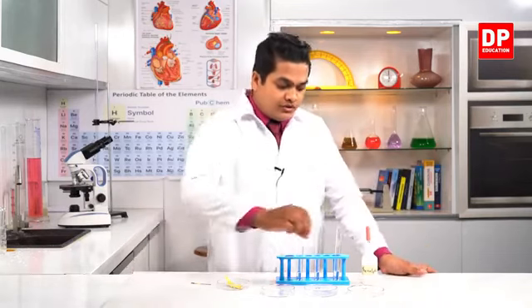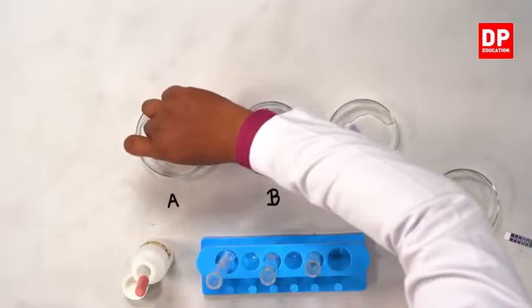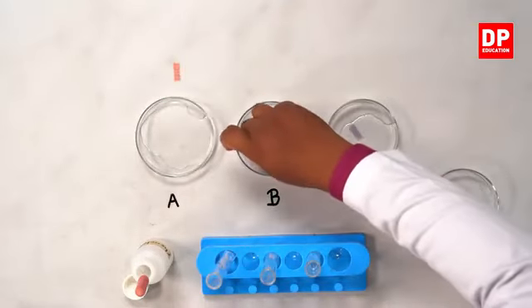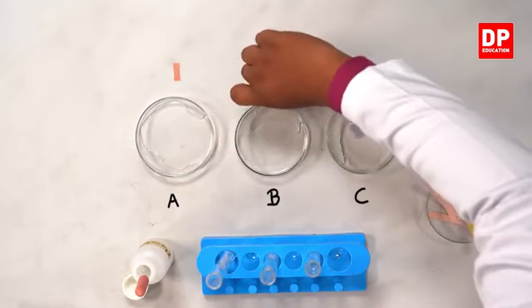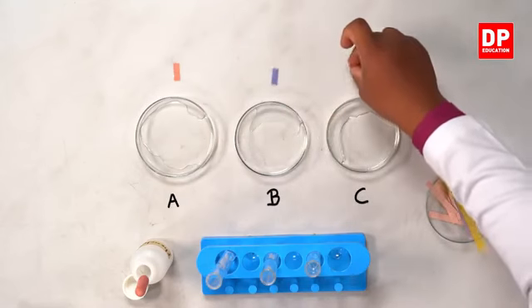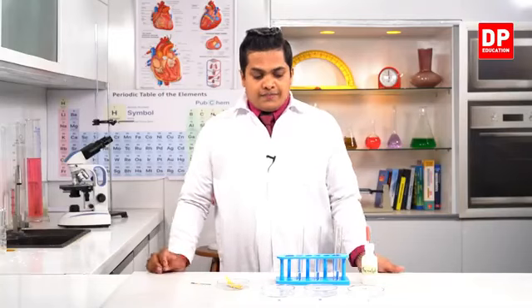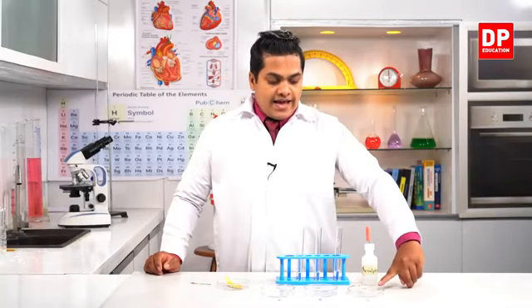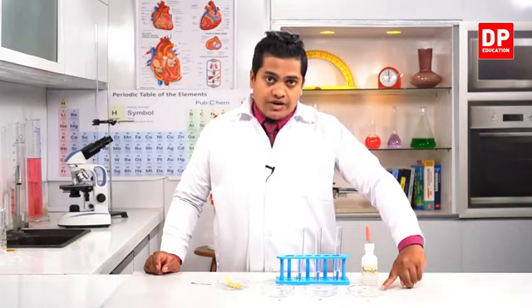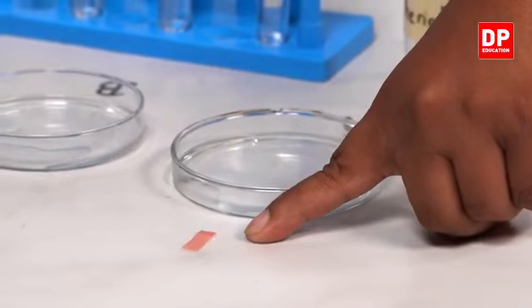So first of all, I'm going to take this one that has blue litmus. So this is the observation with the blue litmus. A, this acidic solution or the hydrochloric acid, turned blue litmus to red color.